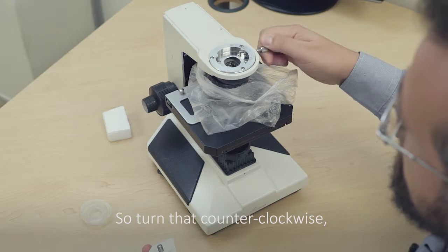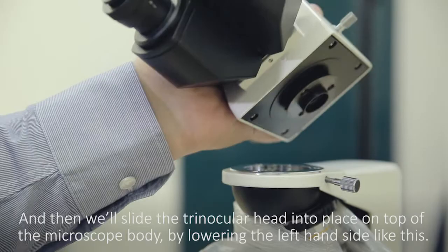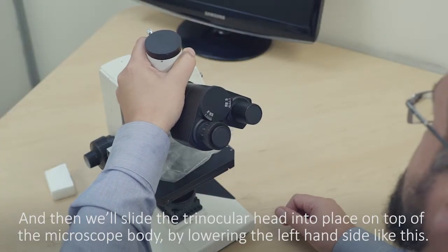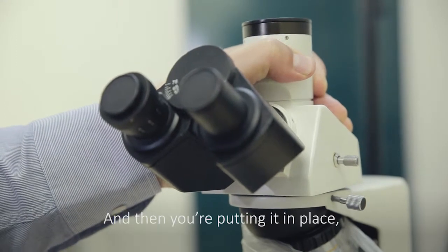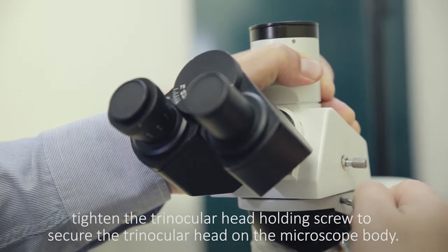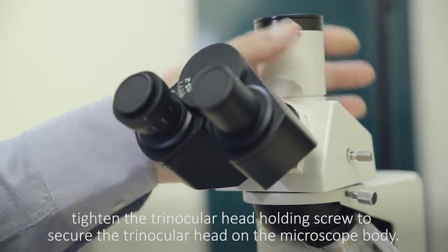Turn that counterclockwise and then we'll slide the trinocular head into place on top of the microscope body, lowering the left hand side like this and then putting it in place. While you're holding it in place, tighten the trinocular head holding screw to secure the trinocular head on the microscope body.